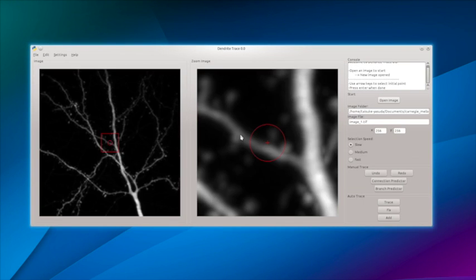When I opened that image, that file was actually a three-dimensional image, but it projected it down to two dimensions, which are the X and Y, and it showed the full image here, and a zoomed-in version that cuts out this box to this part, the zoom image.